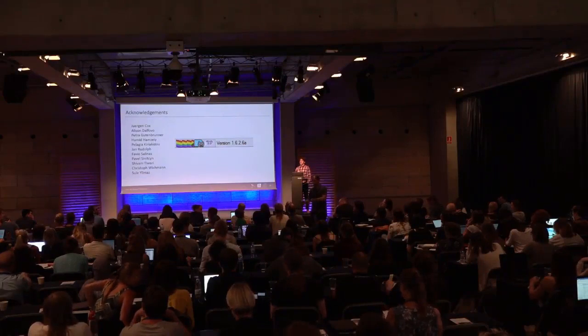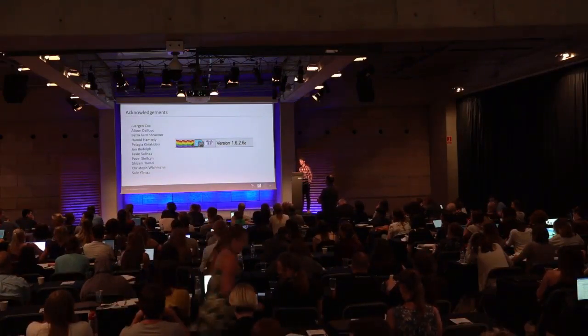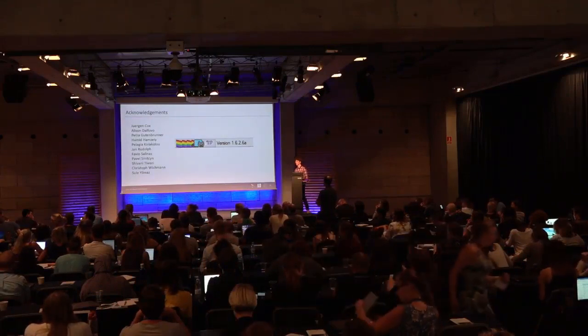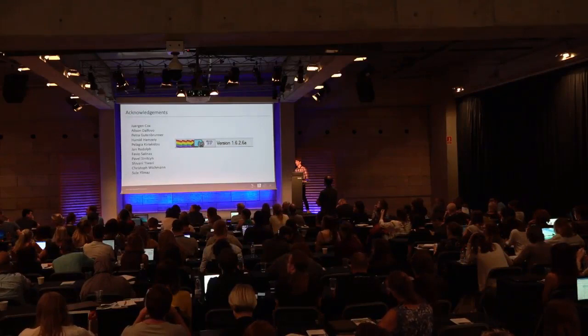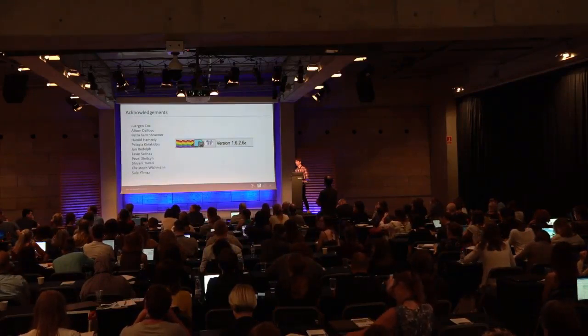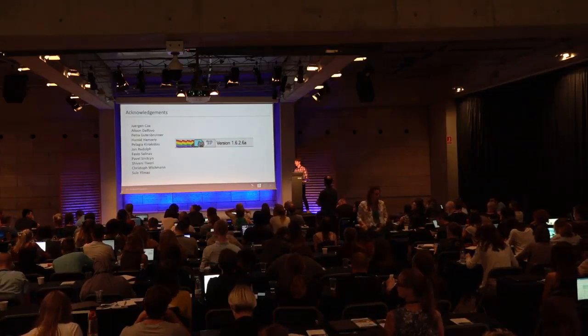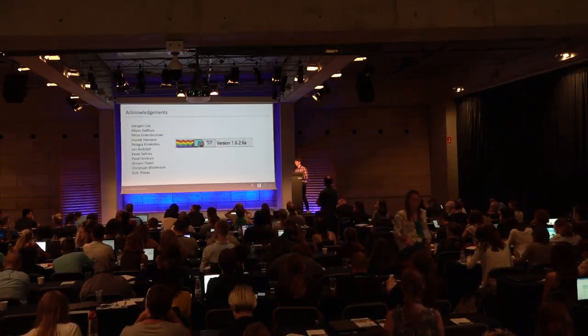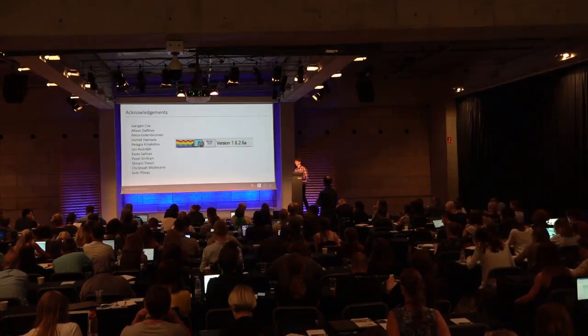Yeah, I have a question. I don't really know how the search works in MaxQuant, but when you choose PTM, you choose STY or ST. Would there be an advantage in having an option where you just look for Y? Because that's a completely different one. Is there any difference, or is that the way it works?